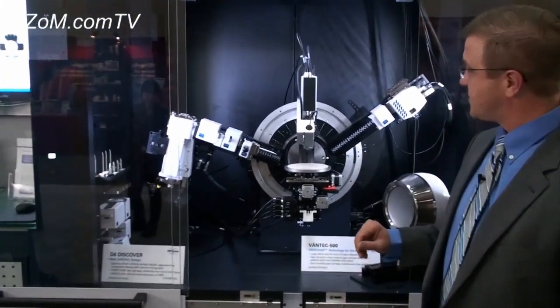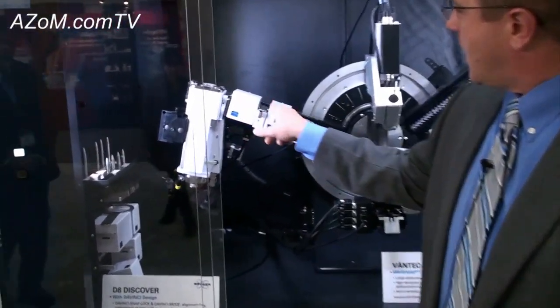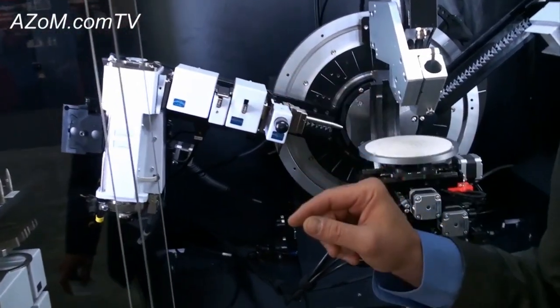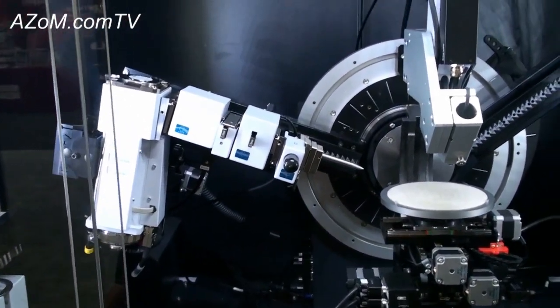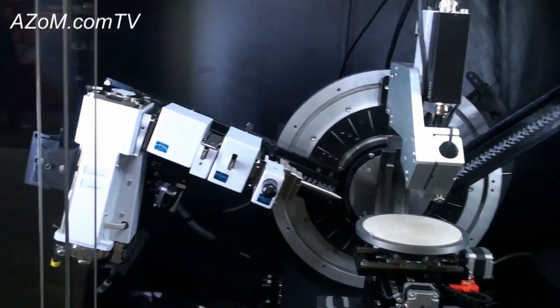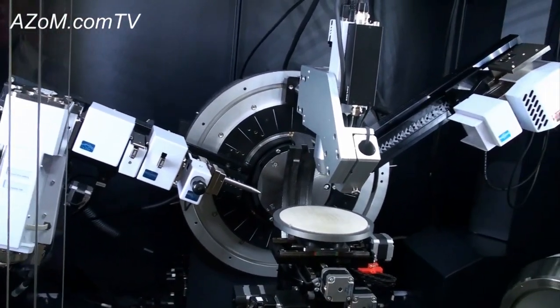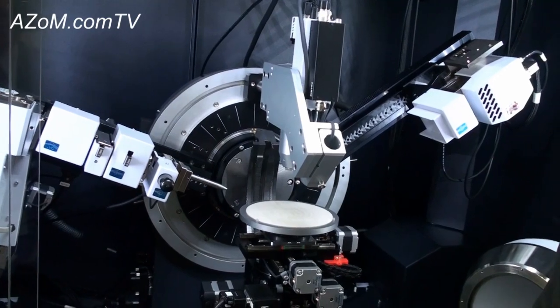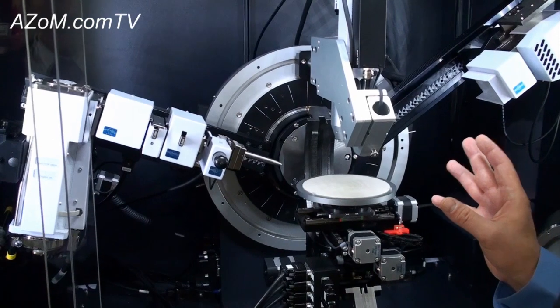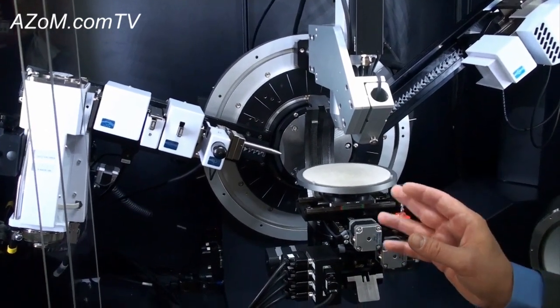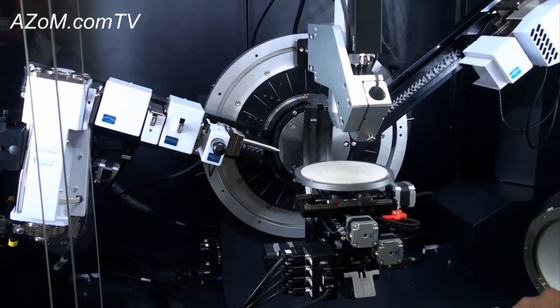Some of the key components to the system itself are the easy exchange of optics here. One of the things that we find, especially in common modern-day university and industrial facilities, is the need to hit as many different applications as you possibly can within that particular laboratory environment. So the ease of switching a system over from one configuration to another is really crucial for these particular markets.